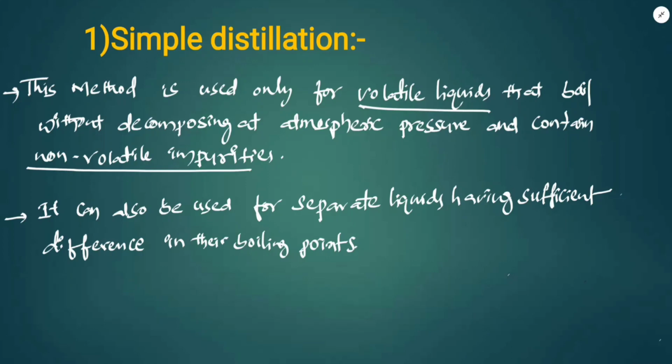See, it is used to separate liquids which have a large difference in boiling point. Liquids whose boiling points differ by more than 40 degrees Celsius can be purified.